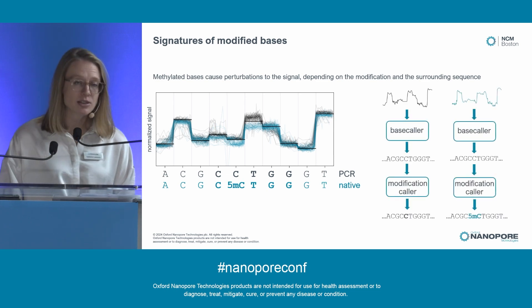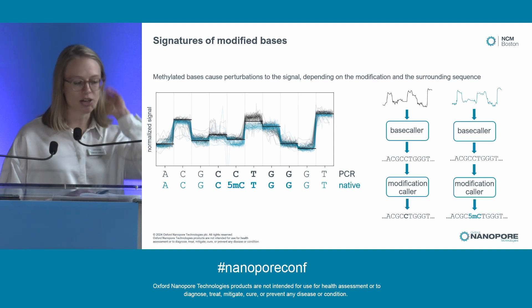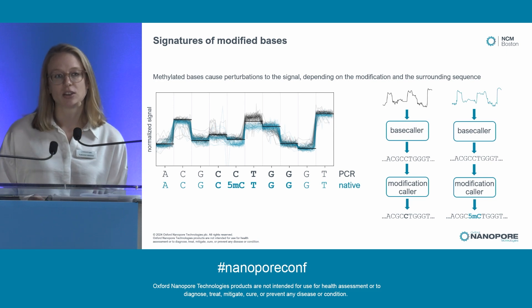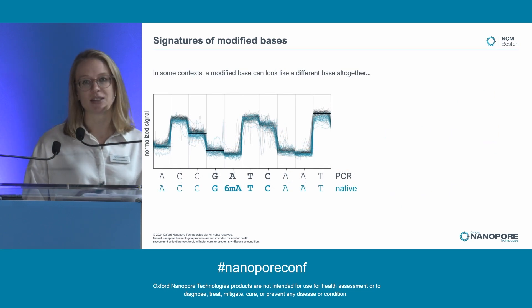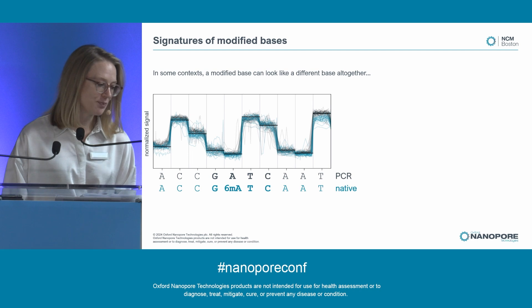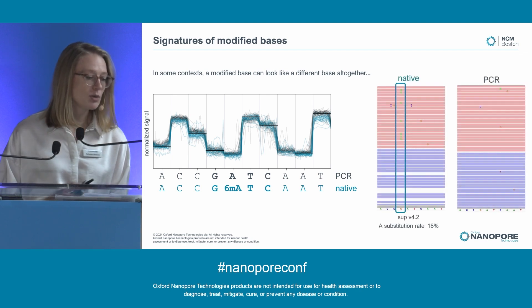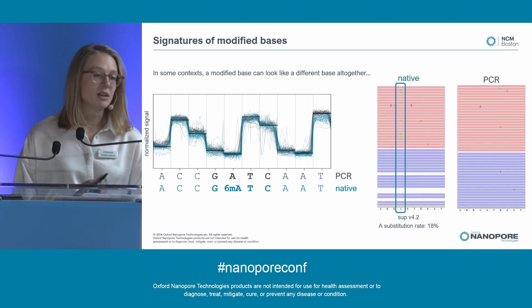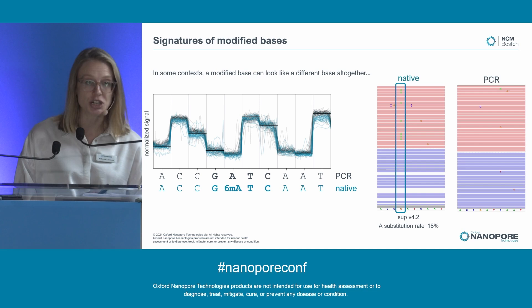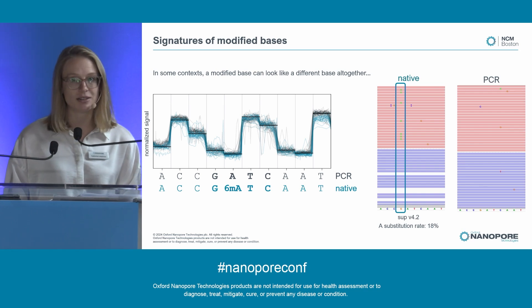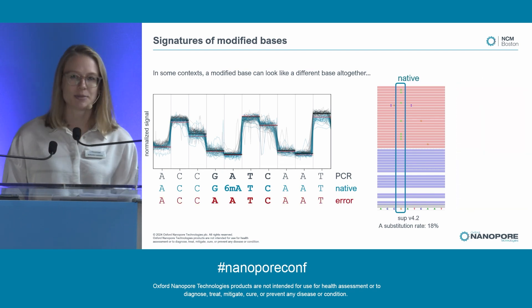The base caller's job is to identify the canonical sequence of bases, then pass over to the modification caller to classify modifications. The base caller has a tough job because modifications can cause different types of perturbations in different sequence contexts, and if we're especially unlucky, the modification can make the signal look similar to a different sequence of bases. For example, in the same isolate with a different motif — GATC with a 6MA — the base caller makes the same mistake relatively often: in 18% of reads, there is an A substitution at the G position of GATC. These are all on the forward strand next to the 6MA, and this error is not present in the PCR data.